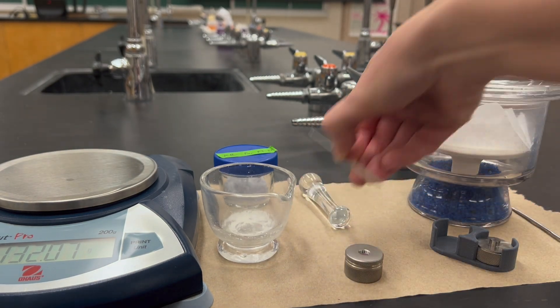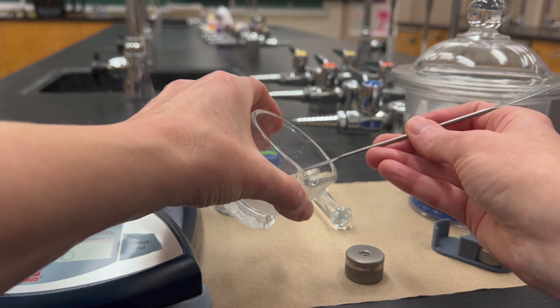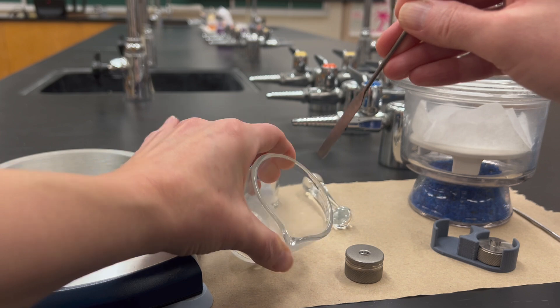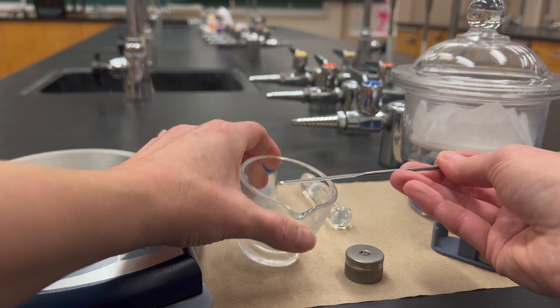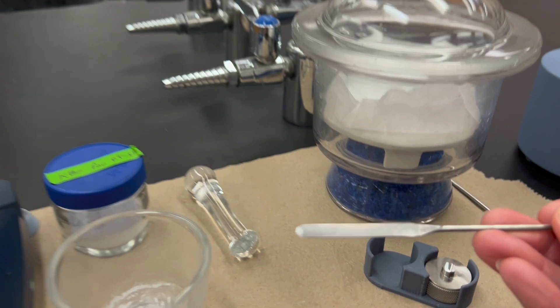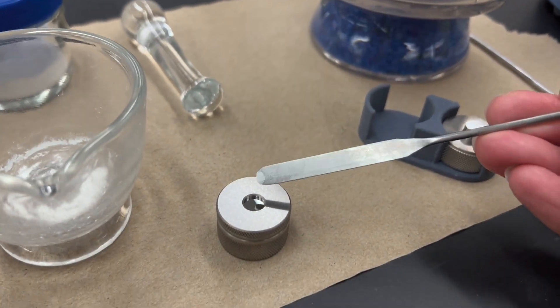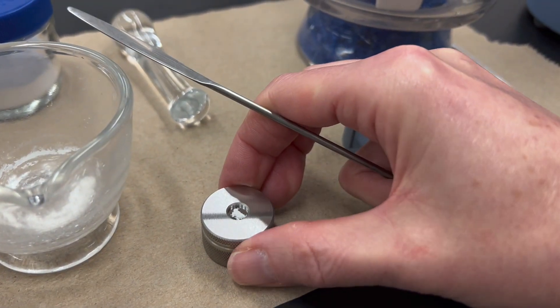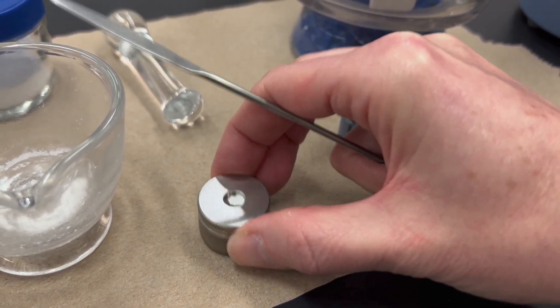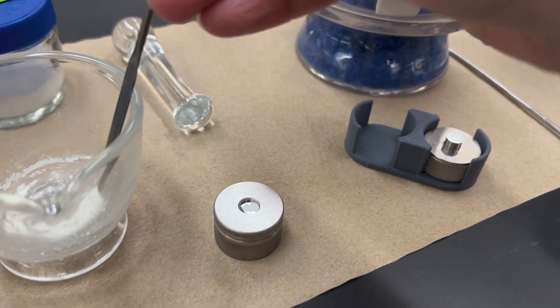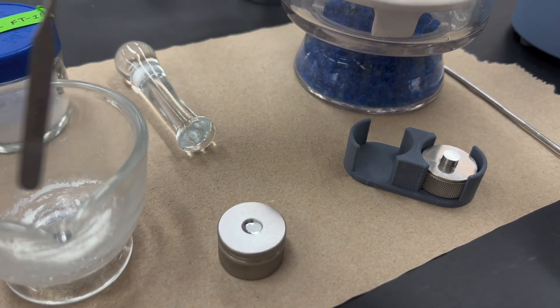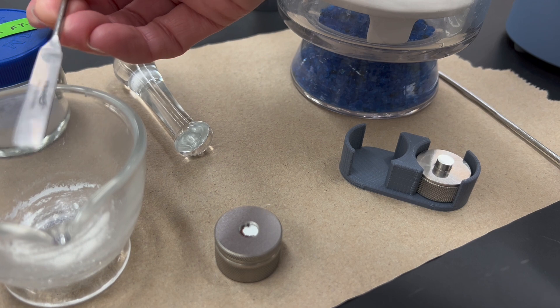Take a spatula tip and put a small amount of the KBR sample mixture into the hole. This is a part where you don't want to add too much. You don't want to add too little either, but if you overload it, you're going to get a really thick opaque KBR pellet, and we don't want that. We want basically the minimum amount of sample that will just cover that hole in a very thin layer.